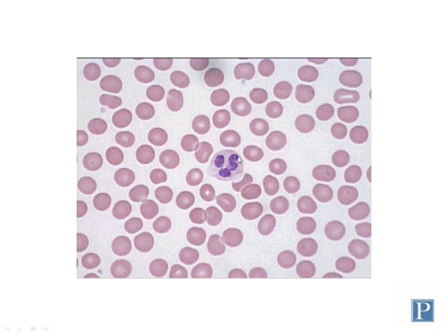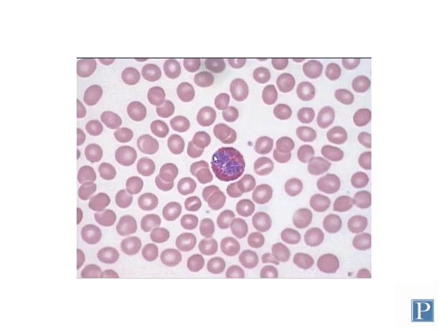This particular neutrophil has 4 discrete lobes. And it might not look like they're connected, but there are small bridges of nucleoplasm which actually connect these nuclear lobes together. So this is a neutrophil. Neutrophils are antibacterial cells that are commonly found in the blood. You should have no problem finding neutrophils at all.